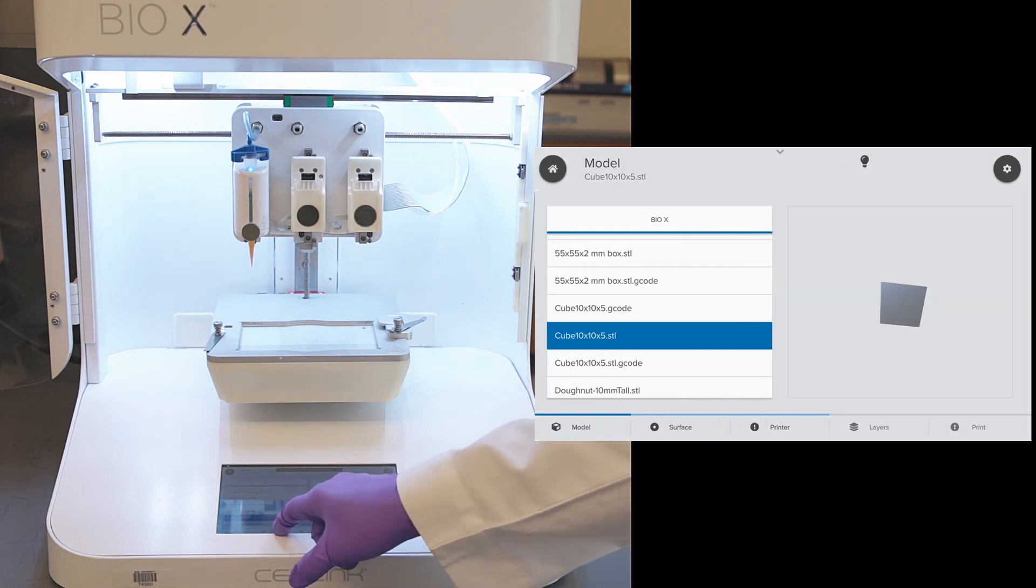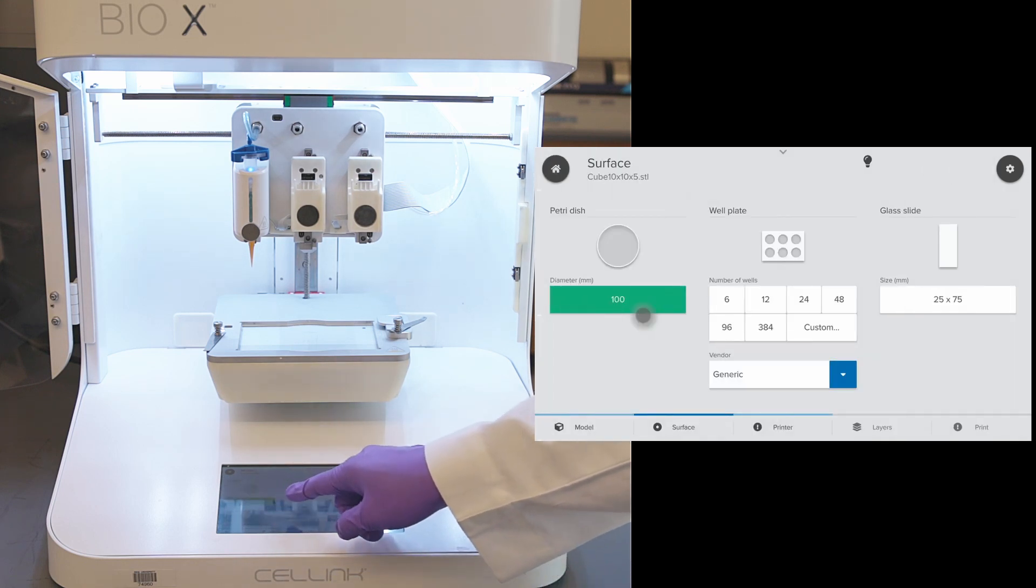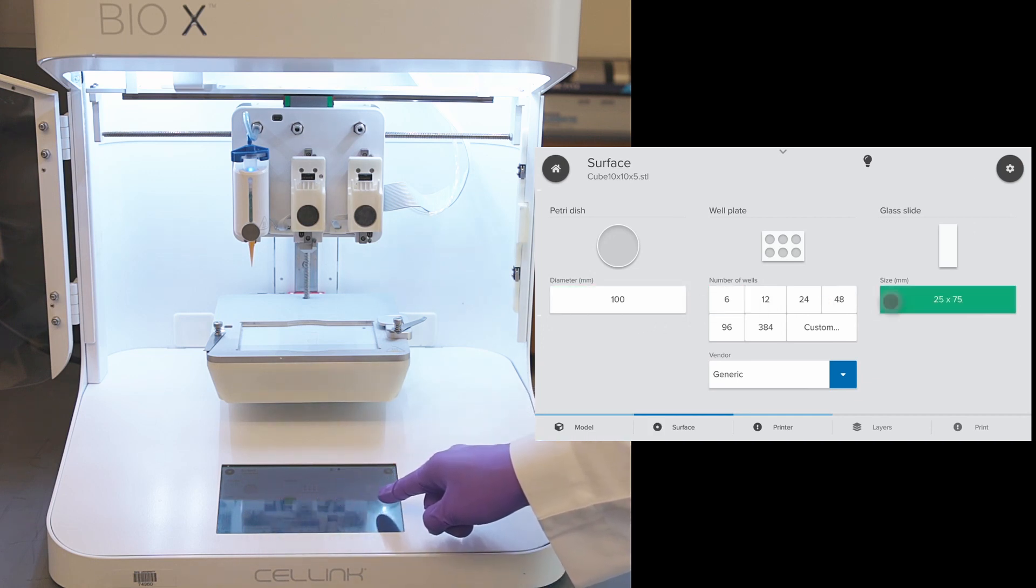Next is the surface. We can choose to print on a petri dish, a 6-well plate, or a glass slide. Today, we will be printing on a 6-well plate.